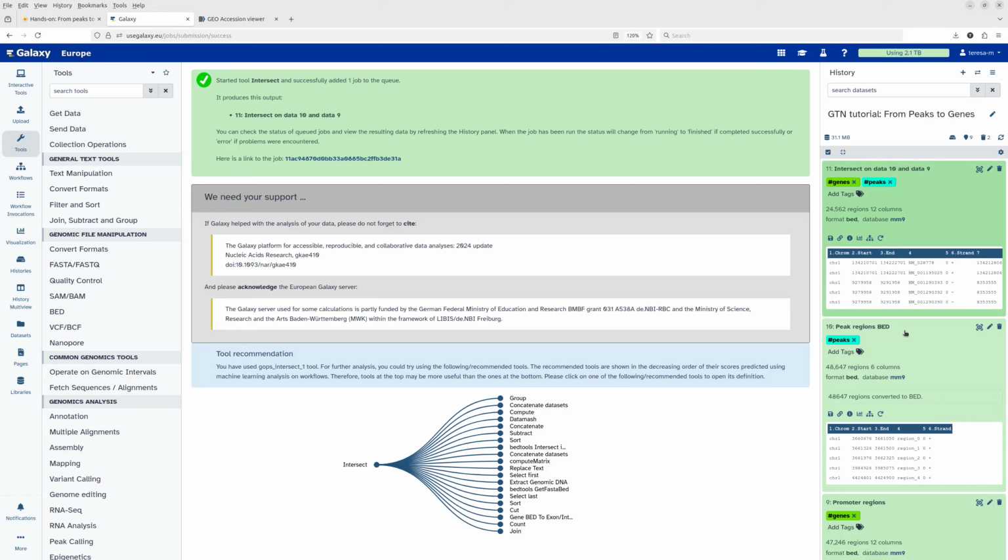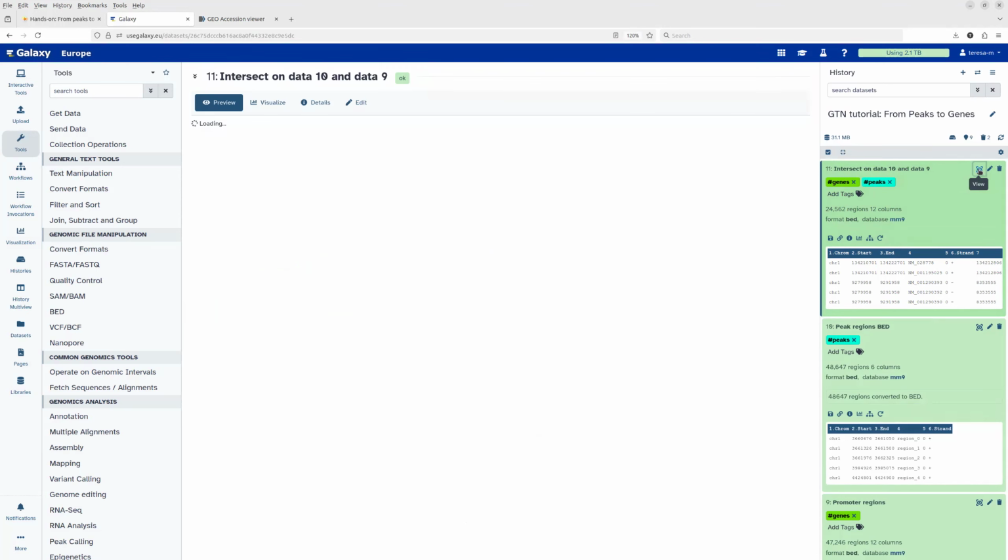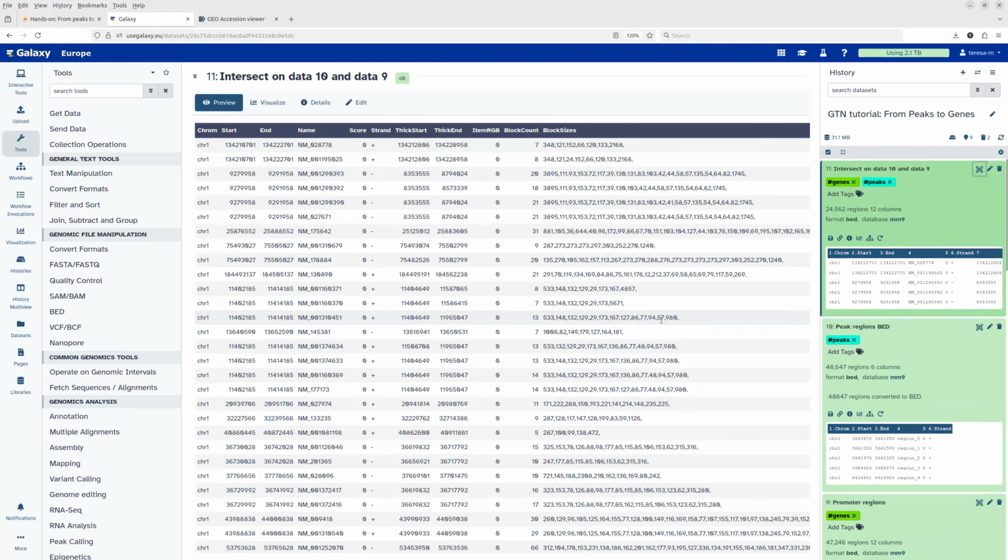And one question that you would like to visualize is, for example, for which chromosome, how many genes were detected on which chromosome? Because at the moment we only have a list with many regions, but it's hard to interpret anything, right?